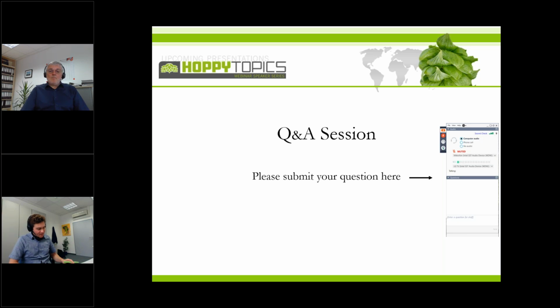Then also picking up the UV spectrum method again with regard to polyphenols. There's the EBC 911 for polyphenols in beer, and the question came up: is this also suitable for the total amount of polyphenols in dry hop beers, and how much is the impact of the polyphenols on those kind of beers? Okay, by this method, of course, you mainly measure the catechin type flavonoids and polyphenols, which are mainly introduced by malt. About 80% of this type of compounds come from malt, and only maybe 20% from hops.